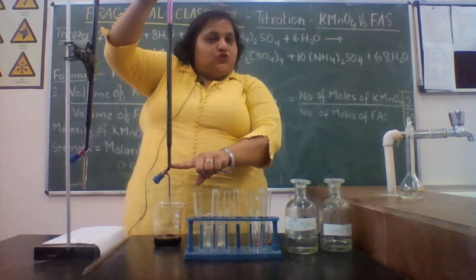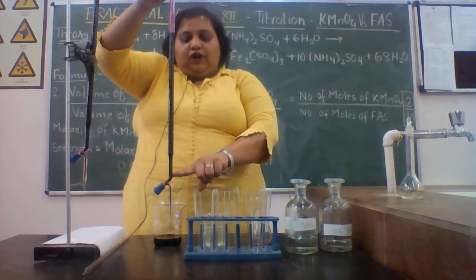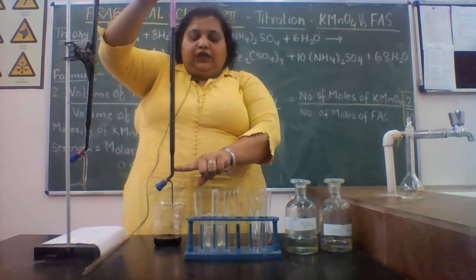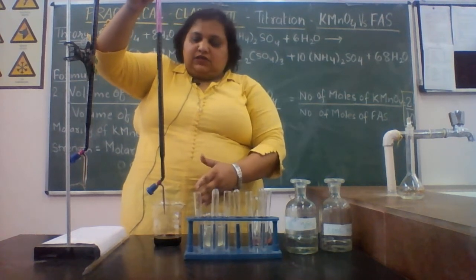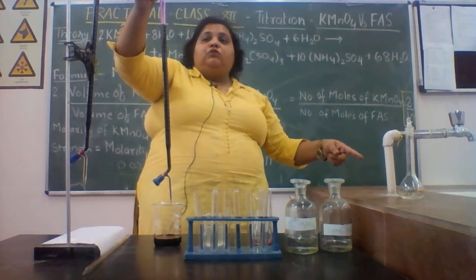No air bubble should be there, otherwise the volume is going to change. To avoid this kind of experimental error, you need to remove the air bubble, and for that you have to open the tap fast, right. Then you have to remove the funnel.